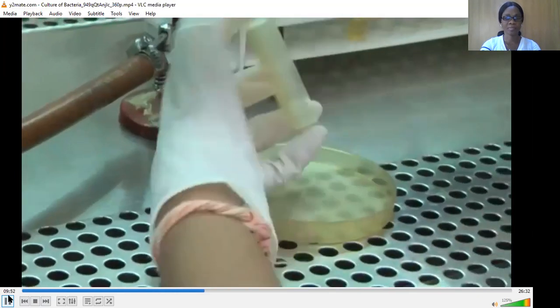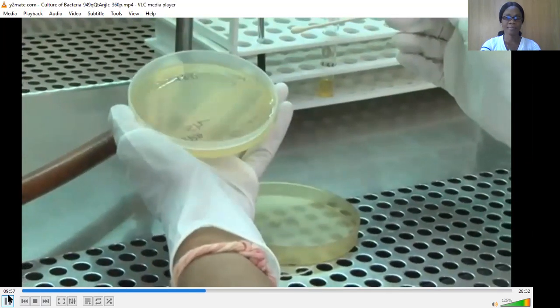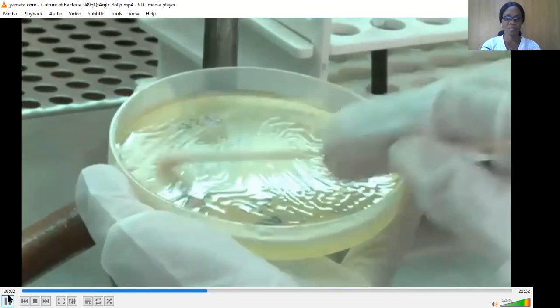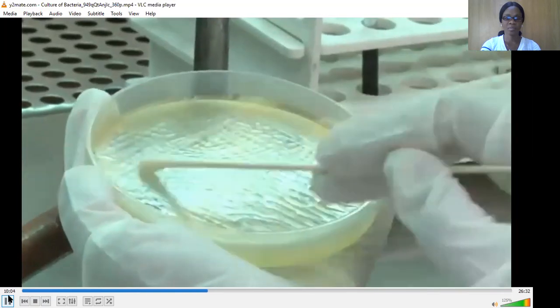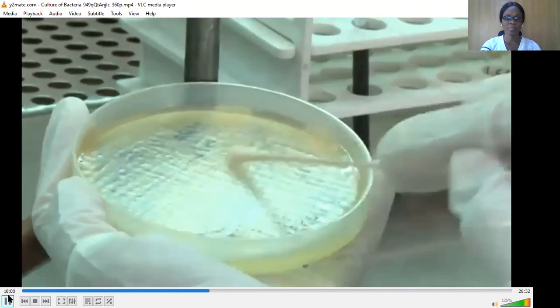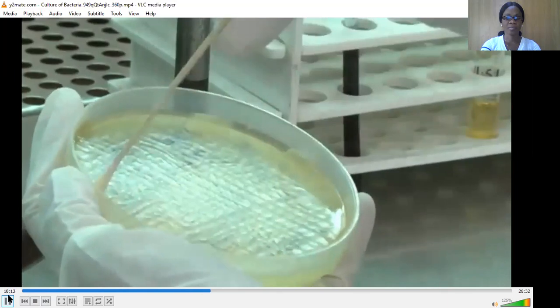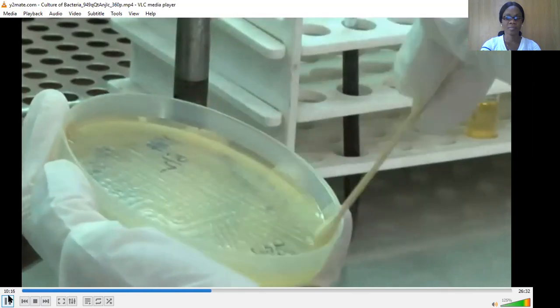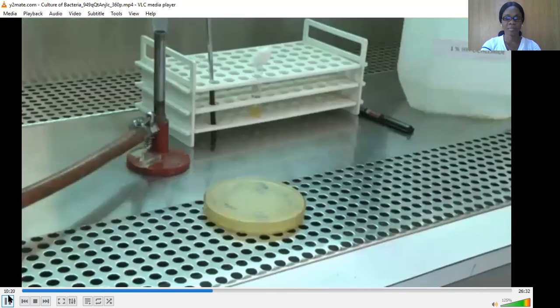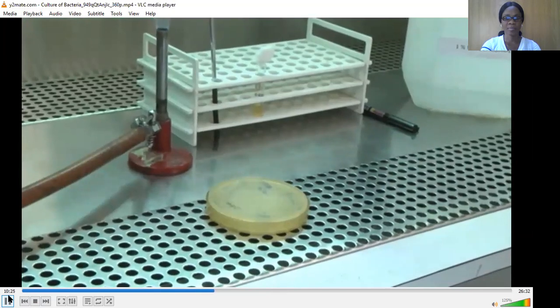Lift the base of the plate containing the medium in your left hand and hold it using your thumb and middle finger. Streak the swab all over the surface of the medium thrice, rotating the plate through 60 degrees after each application. When the whole plate is covered with the inoculum, pass the swab around the edge of the medium. Discard the swab in a disinfectant solution. Allow the plate to dry for a few minutes with the lid closed at room temperature.